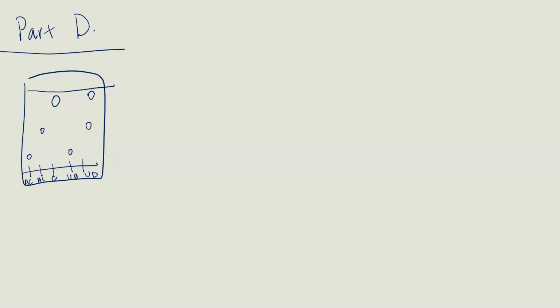So during lab, you were supposed to measure the distance between the starting line and the middle of each spot. So you will have the distance already measured before you leave the lab using a ruler, and you will also have measured the solvent distance. So in millimeters, where you wrote everything down you knew for sure, and then you estimated one place between the tick marks. So that wasn't so much math as it was just making measurements.